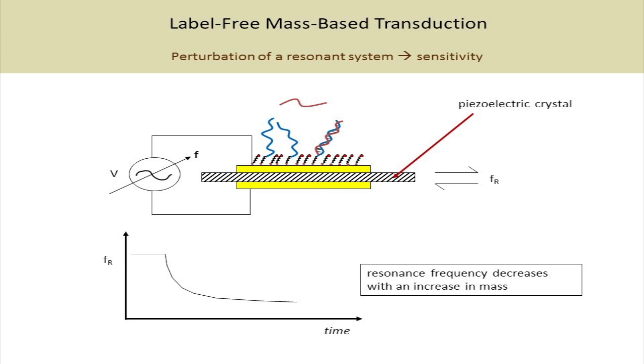They want to get pushed out, right, as the arrows indicate. So we come down, we hybridize, and that pushes the electrons out. But I can say, wait a minute, I'm not going to let them go out. So I'm going to apply a negative potential down here to prevent those electrons from leaving. So I'm essentially going to keep them confined.